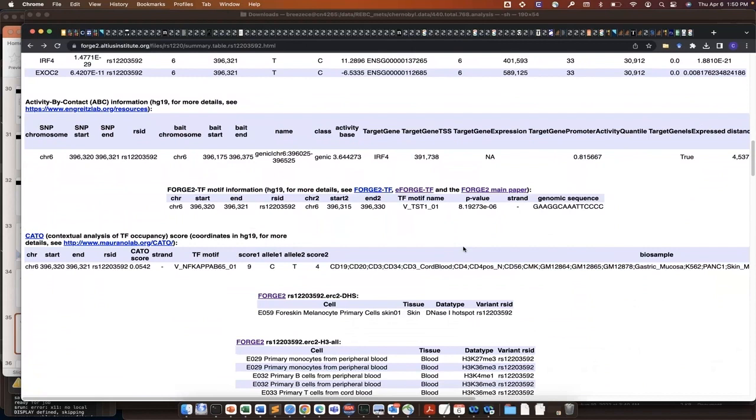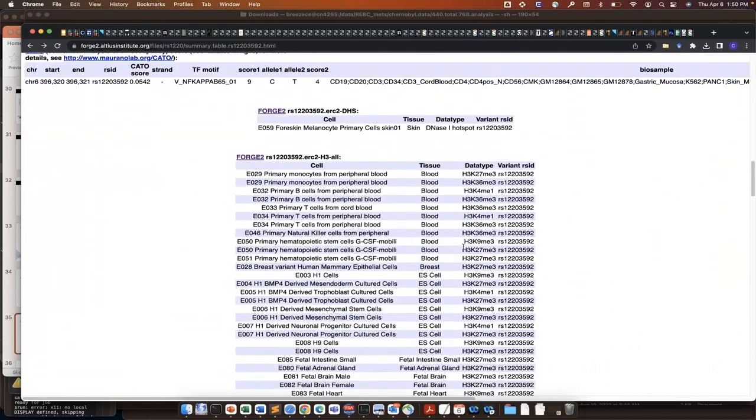So the ABC looping data is purely for a region, and it's usually very high level structure. A SNP can't really affect it; we've seen an example in FTO where a SNP really affects looping, but this is very rare. Most SNPs do not affect looping, and so this is why we do not have it.